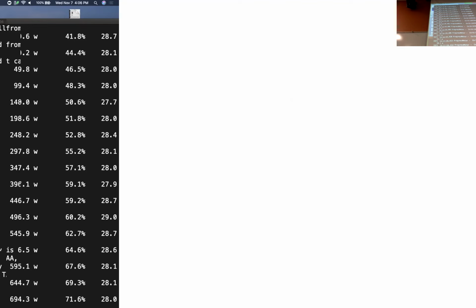So what I can do is go into my multi-sample VCF file or genotype file and say, look across all the individuals in this population for this one SNP. If the ratio of small a and big A deviates from 1:1, that's a bad SNP. Get rid of it. It really works like magic for filtering.